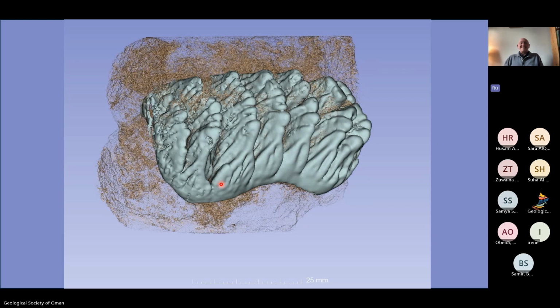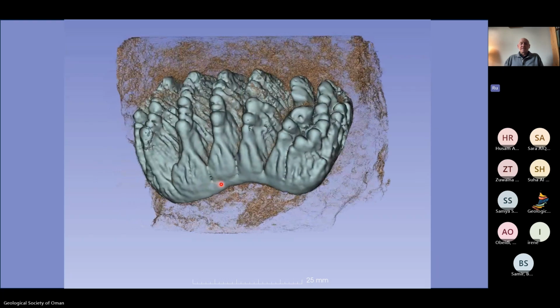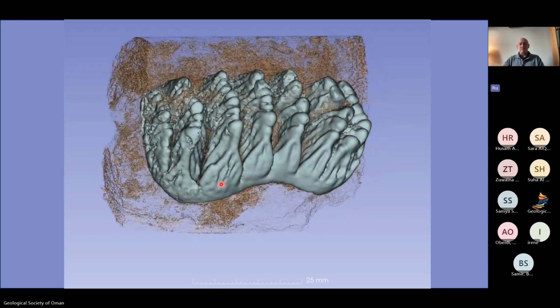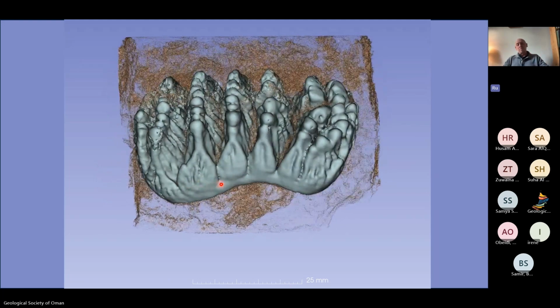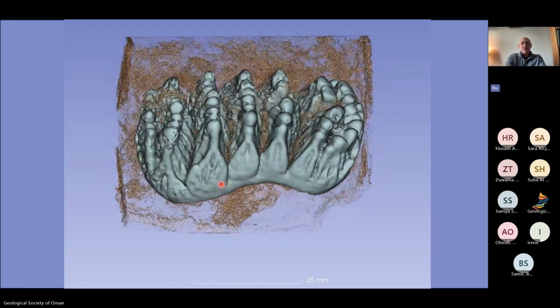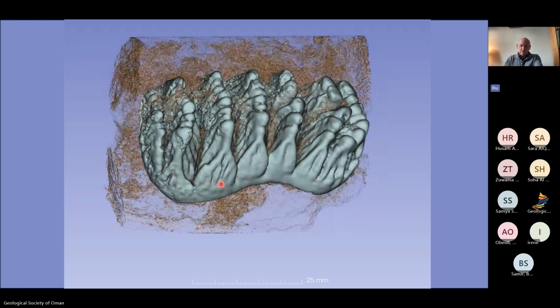This is Malaysia's only fossil of a stegodon, and it's almost entirely still in the rock. What I've done there is interpreted the enamel of that tooth. It's beautifully complete. And I've made the matrix, the rock, transparent or nearly transparent. So it was pretty fortunate. Look at the scale down there. It's a baby.